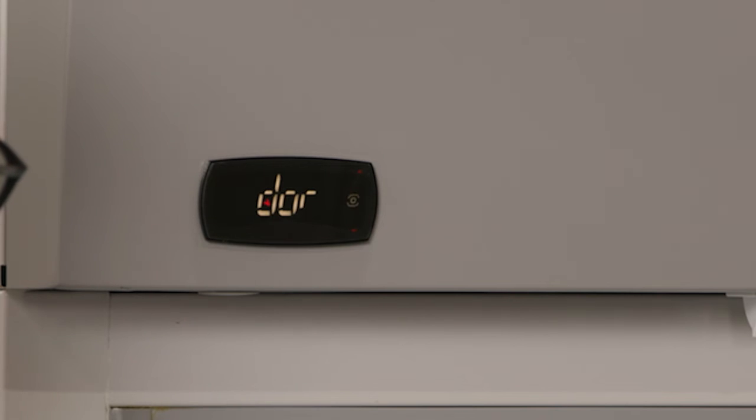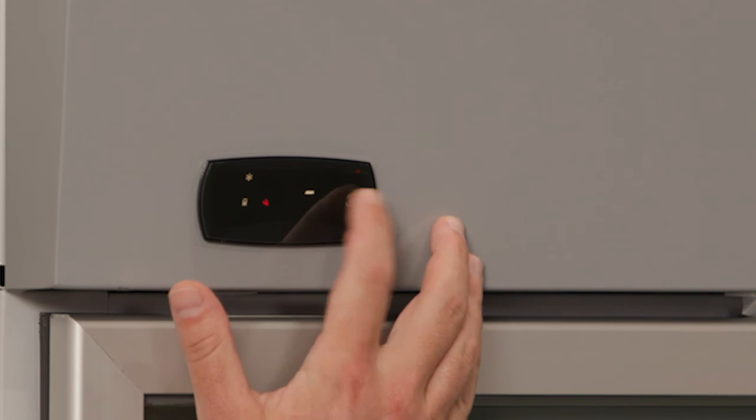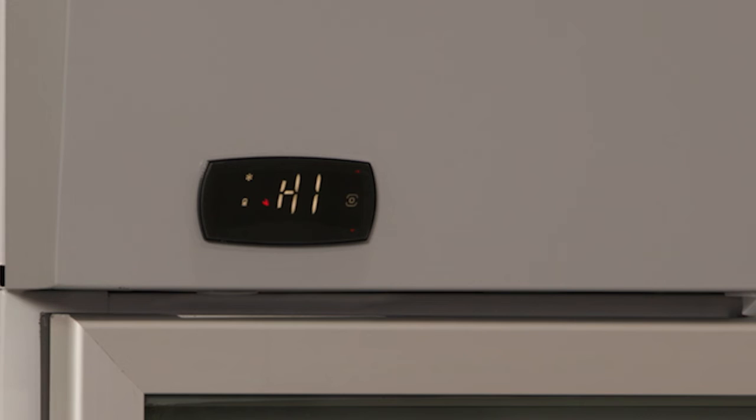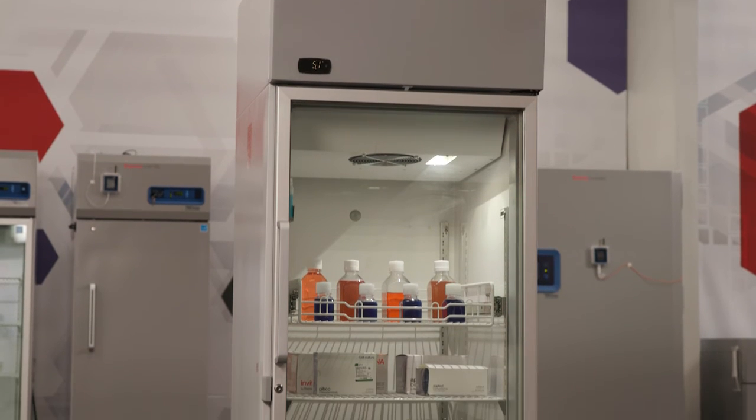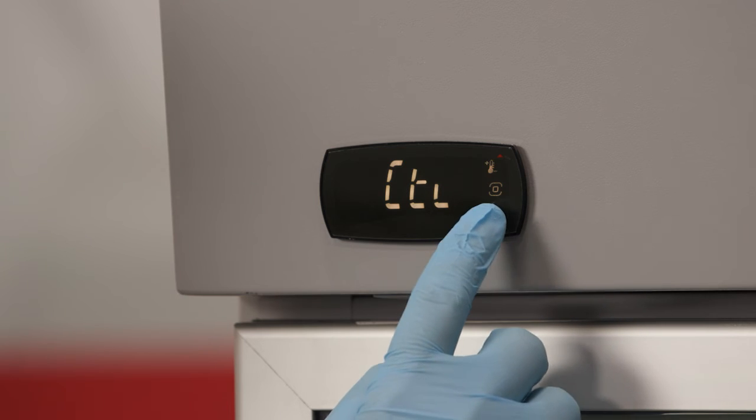Active alarms buzz and the service icon flashes. An alarm code is displayed and alternates with the main value. Multiple error codes will be displayed in sequence. Press any button to mute the buzzer for 30 minutes. Up to five alarm records are stored when alarms are cleared. Older alarm records are overwritten in a rolling list.